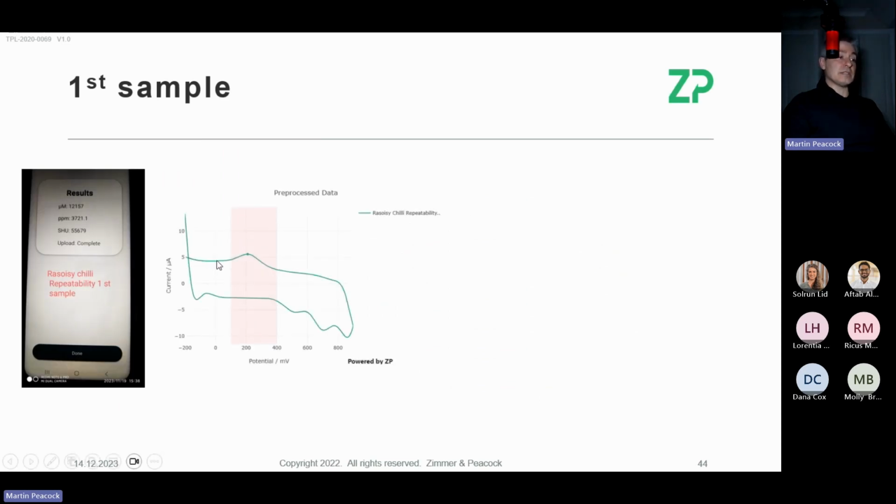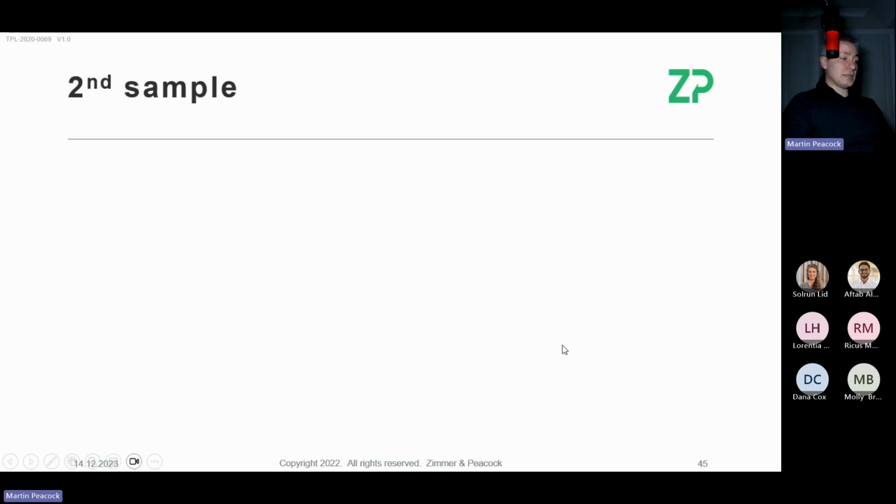I can see the capsaicin, I can see the peaks. The only reason I was talking about that Oxford University work earlier on was to say, look, there's real science behind this, and that's why we know that this is capsaicin and not something else. So they had 5 results, and we were able to actually look at the data.